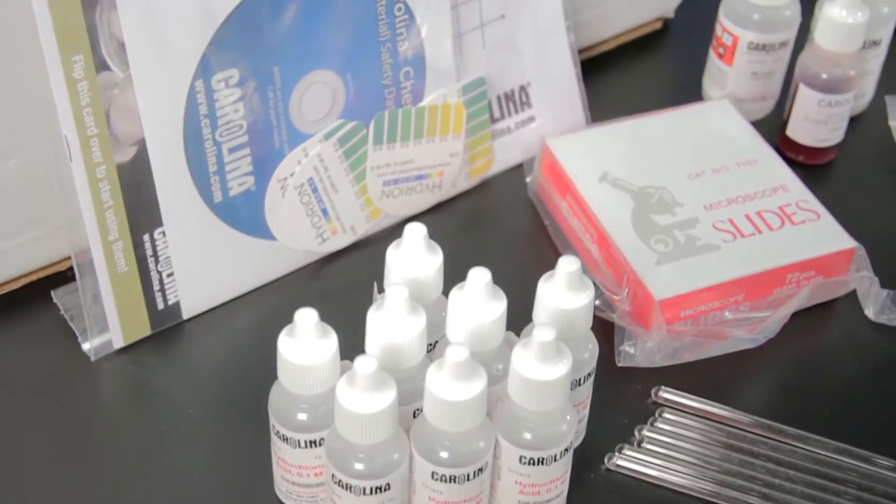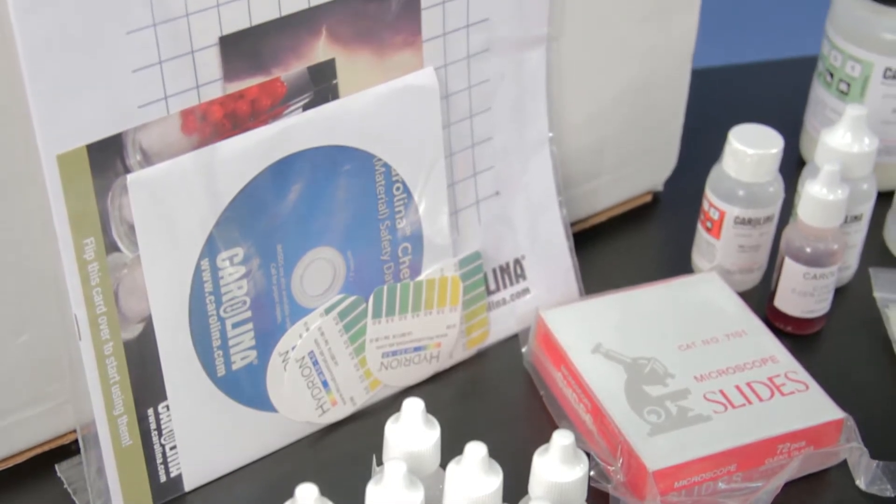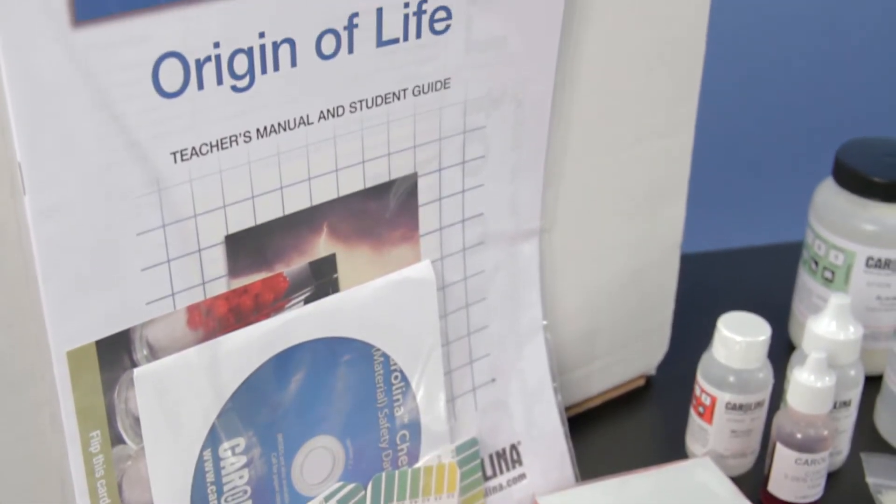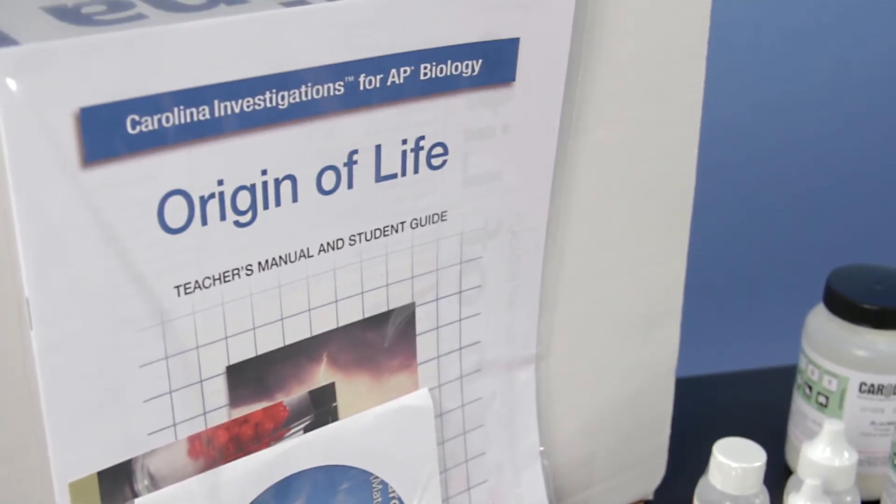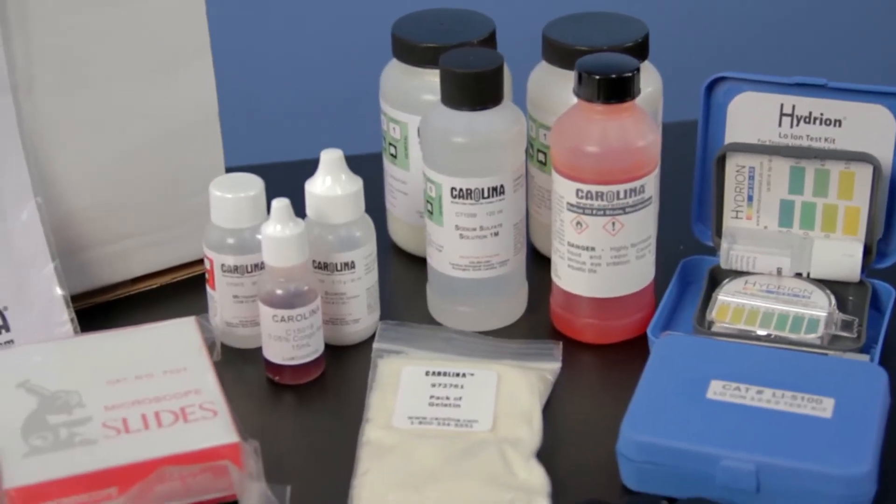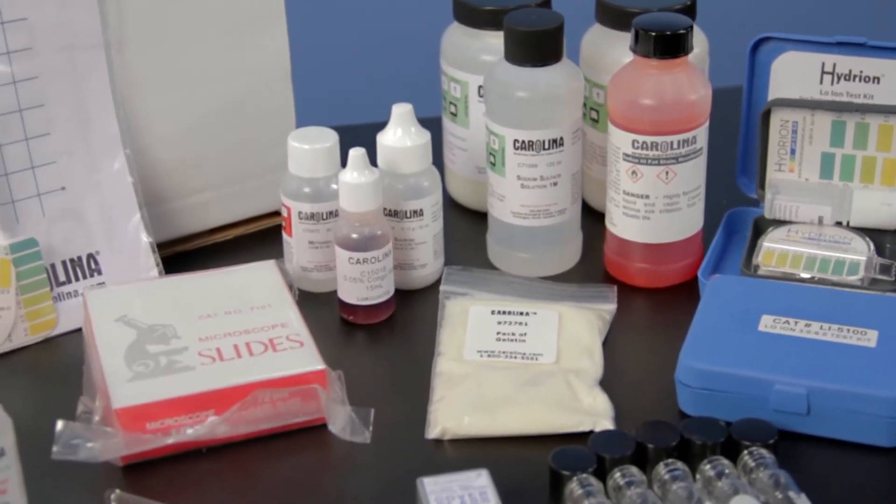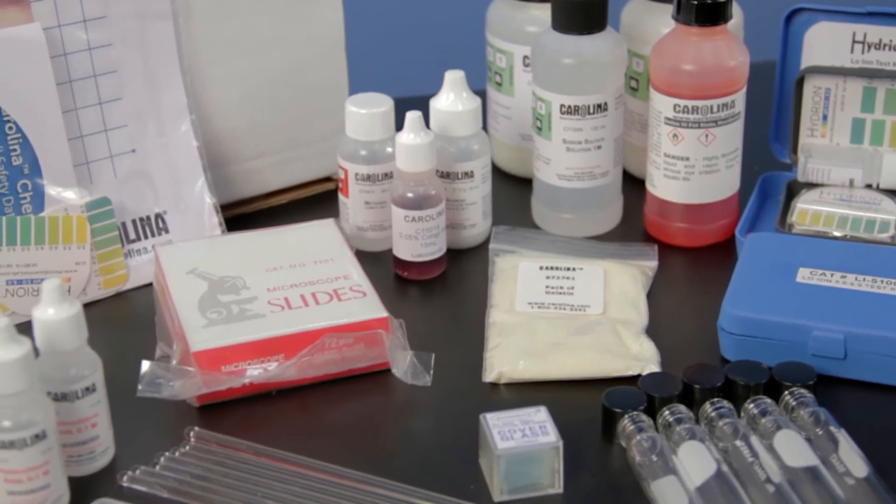Always taught concepts like the Big Bang and the origin of life without a real concrete activity to reinforce the concept? This lab offers a simple introductory lab to bring this concept to life while introducing inquiry in a simple way to your classroom.